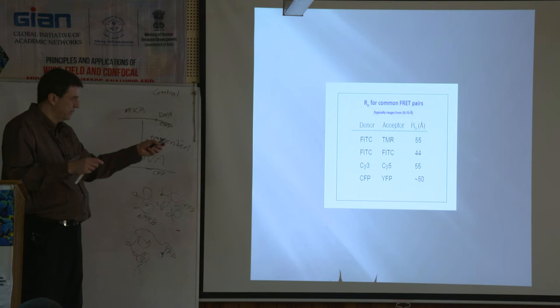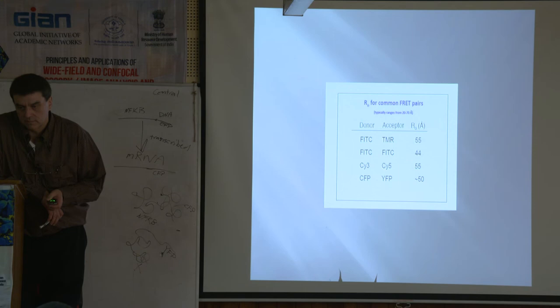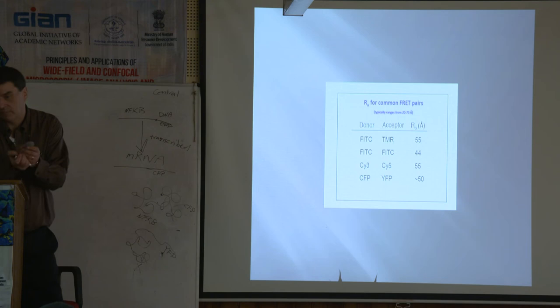How do we know that these two molecules are working together, or that the marker molecules aren't interfering with that coordination? How do we distinguish between that? Well, if you get FRET and you do everything right, then they are so close that they're most likely interacting. I guess you can't ever say 100%, but they're almost certainly interacting.